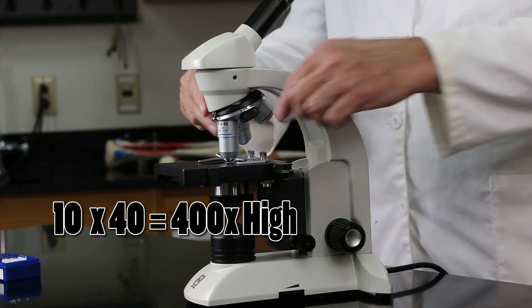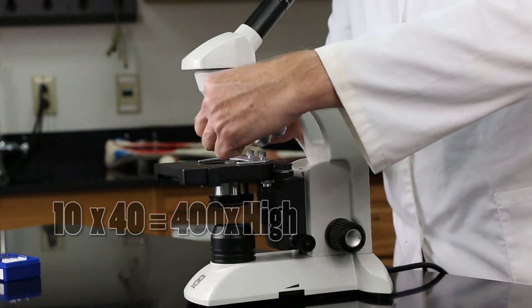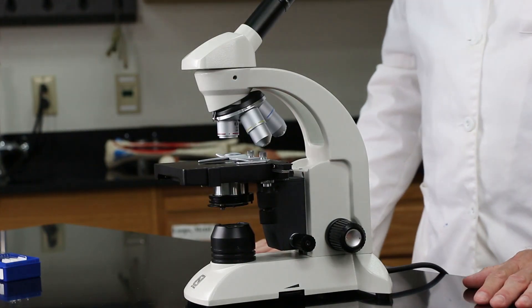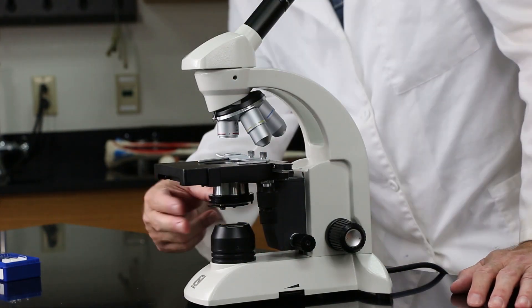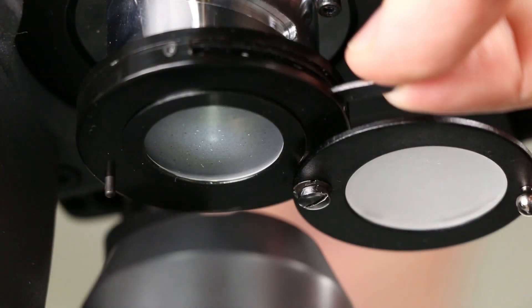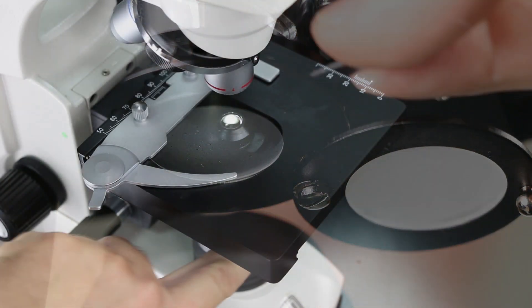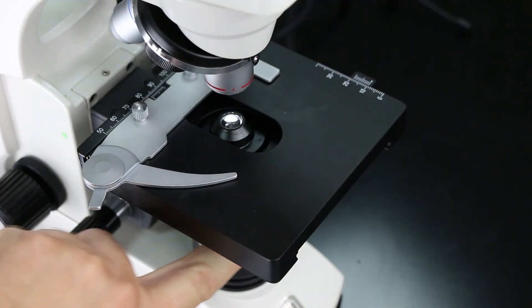Now, I also want to point out a lens that is under the stage, too. And this is a lens that's called the condenser lens, which focuses the light to a point where your object is on the stage.